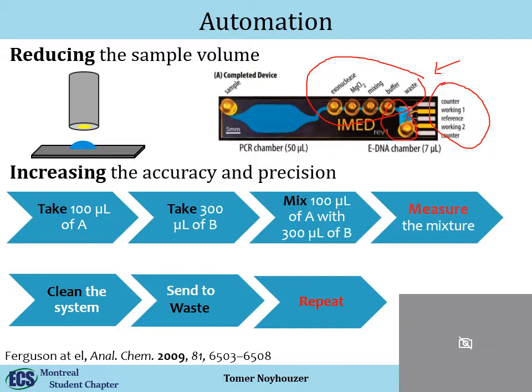Now, unlike a regular measurement, if you need to make a calibration curve, you'll have to take one of those droplets and start measuring different concentrations. So you'll need at least 3 to 5 measurements to have your calibration curve, and then you have to measure the sample. And again, if the temperature changes or anything, it's very hard, and you can add human error at every stage.